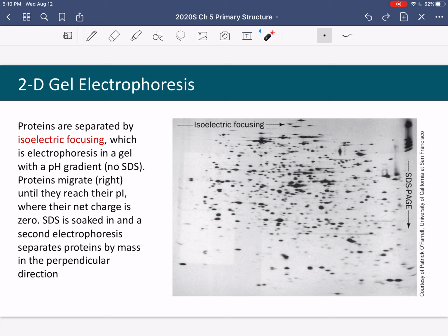So we won't be using isoelectric focusing. I just wanted to include it to identify the origin of the isoelectric point, that pH at which your protein stops migrating in an isoelectric field, and the idea that you can separate in 2 dimensions and get more separation of proteins.